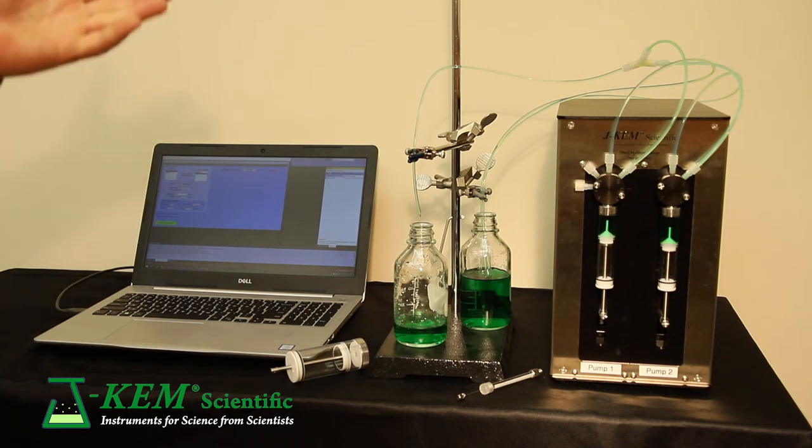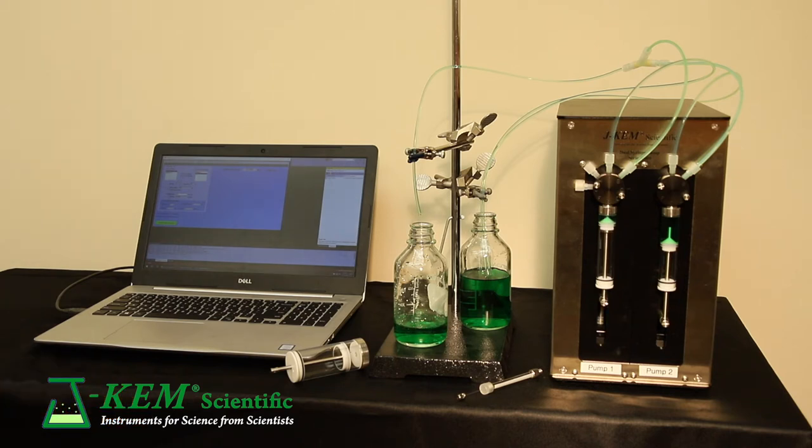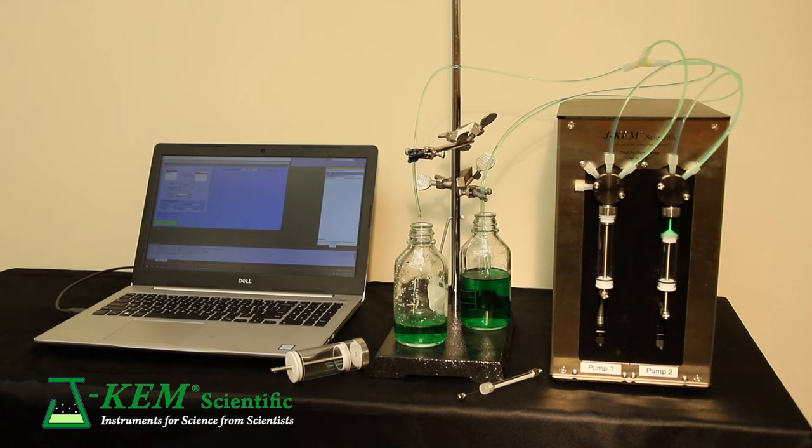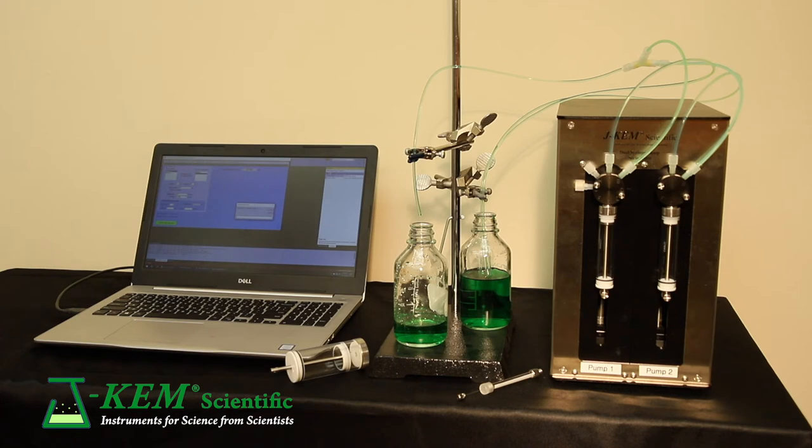In this case, I've asked it to deliver 35 milliliters. And it'll deliver 35 milliliters with absolutely no break in addition. This syringe pump just delivered 35 milliliters of continuous addition.